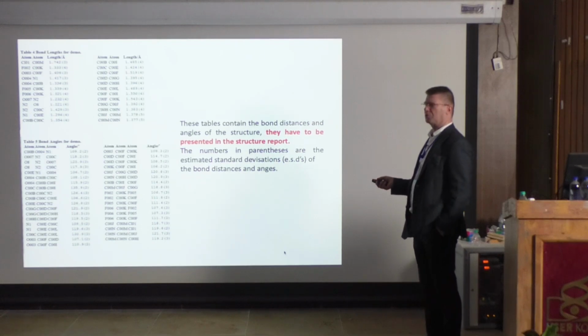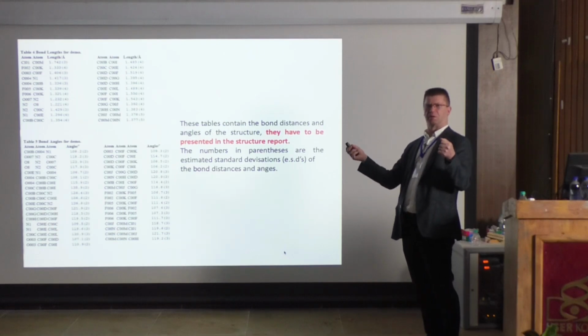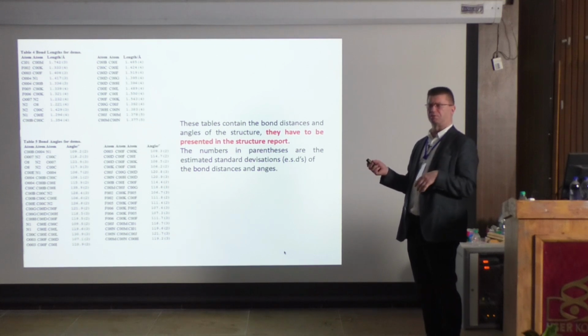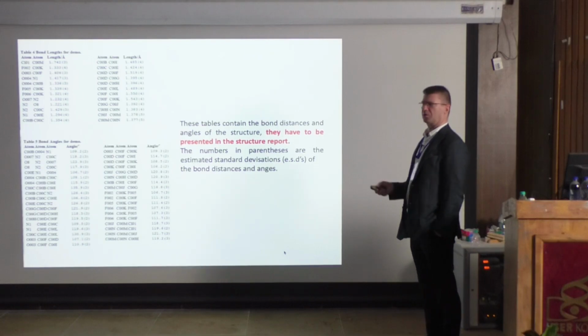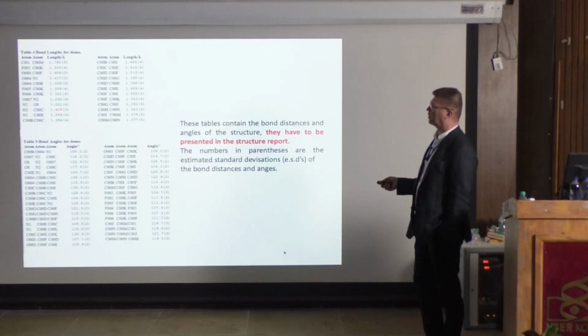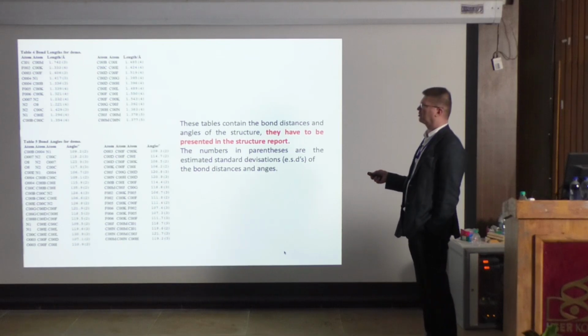And this you can do sometimes if you're doing an analysis, then okay, is there a statistical difference between the bond distances or angles? Then you have to take this into account. But in normal life, you don't worry, because it's always reported like this. It's a historical reason. So the 3 sigma would be better nowadays because it would be more accurate. But of course it's easy to calculate.